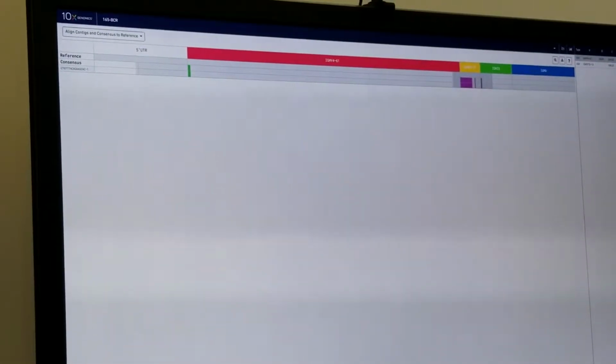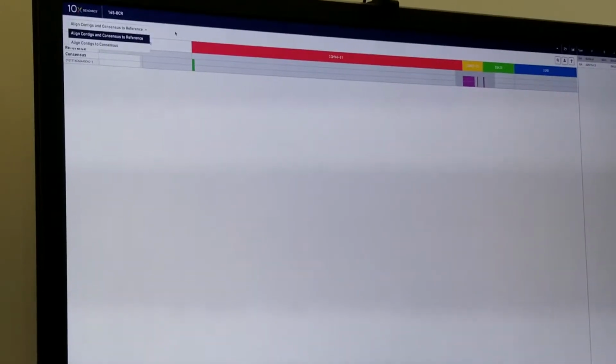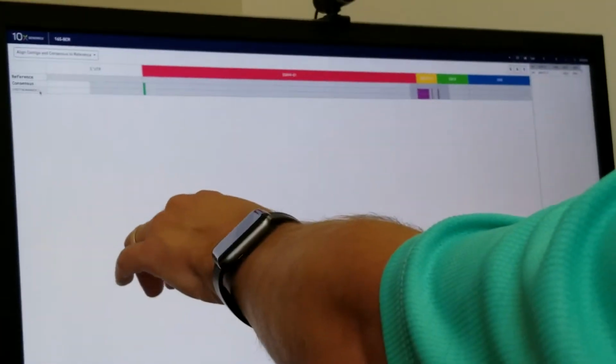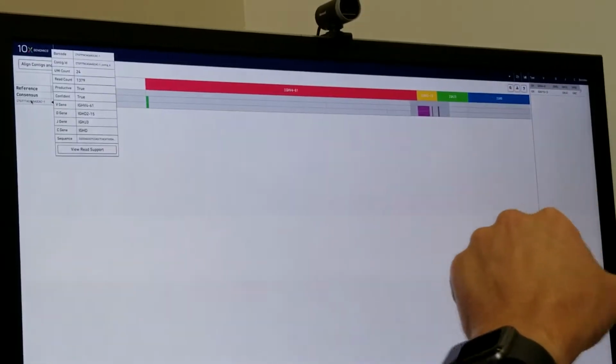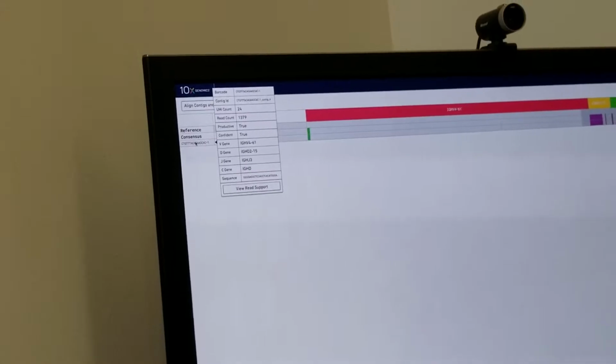Now, Greg next week should be helpful on this, right? Because he's Mr. Heavy and light chain. So when you come over here and you hover over, you do see which genes are being used, which V gene, which D gene, which J gene. Right, so it's clearly showing there's a large deletion of 18 bases here in that CDR3 region.